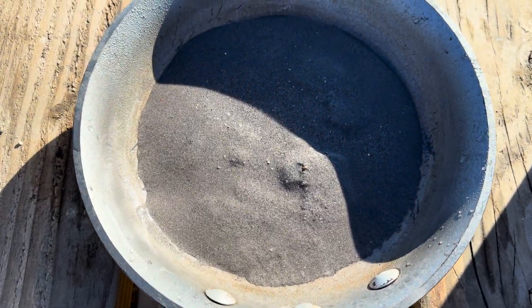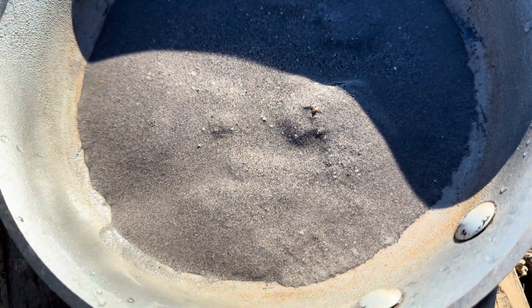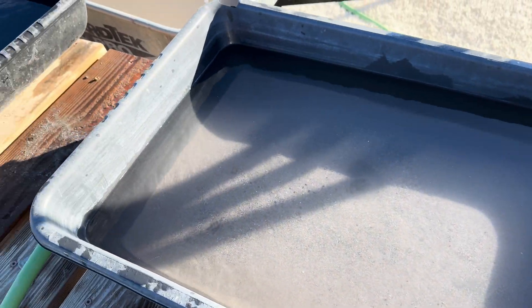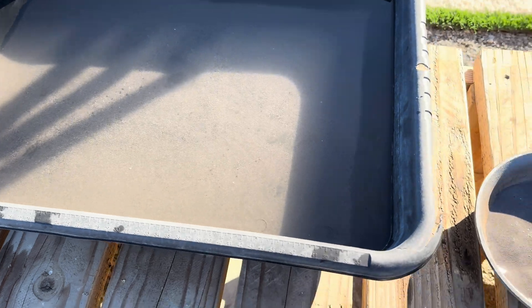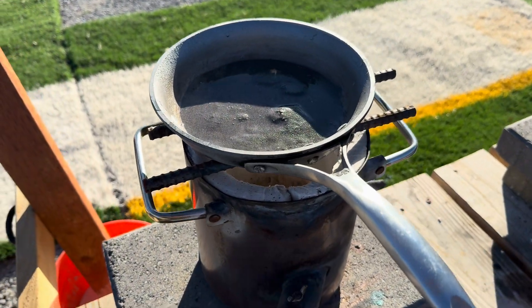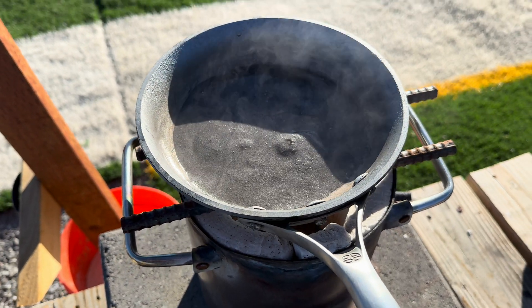Here is the concentrate that I had hand panned out of the 40 pounds of ore and now I'm going to roast the concentrate. The reason why I am roasting it is because there's a lot of sulfides in the ore, and by roasting the sulfides it'll turn them into oxides, which will release the precious metals that are inside the sulfides. We will roast to 900 to 1,200 degrees until it stops smoking, then let it cool off and measure how much concentrate we have.